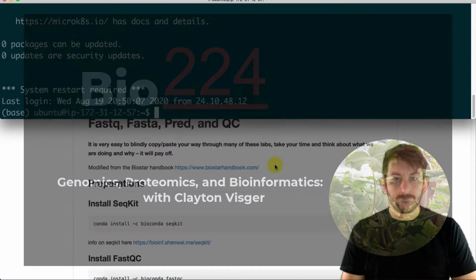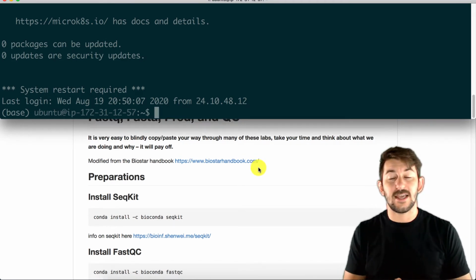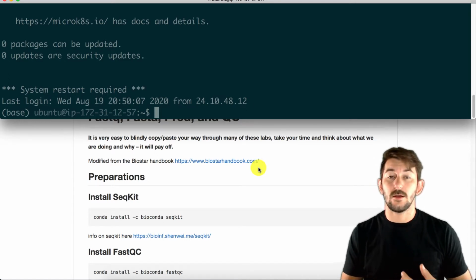Bioinformatics. Okay, so this is going to be a video where I walk through the second lab, which was on the FASTQ, Phred scores, and quality control. Again, these videos are not intended for you to watch start to finish. This is more a resource for if you had areas where you stumbled, or you would like to see how I did it, or maybe some other things that I said along the way.